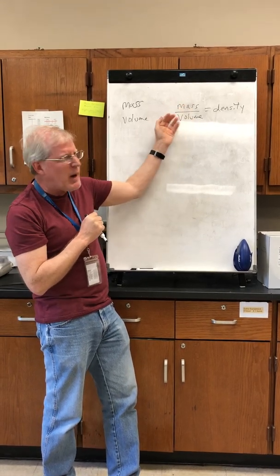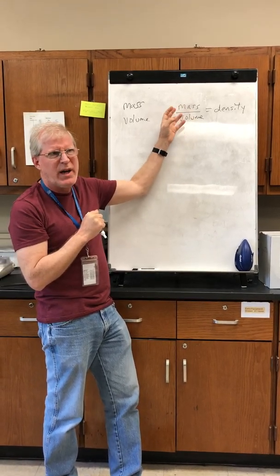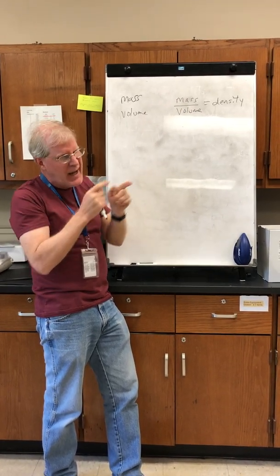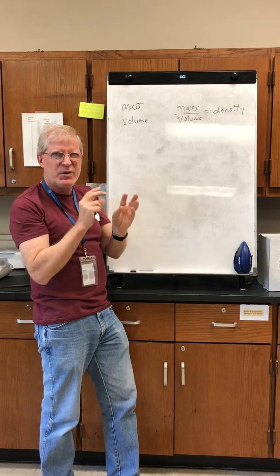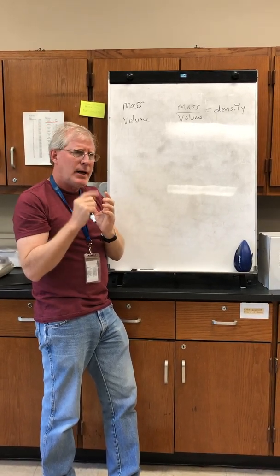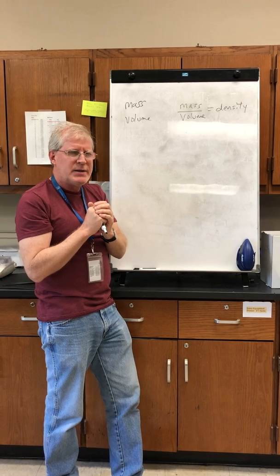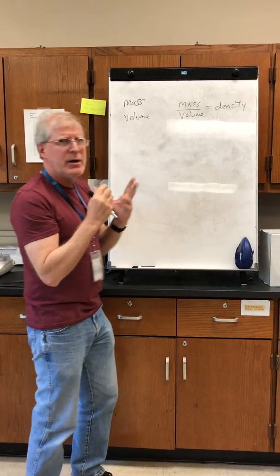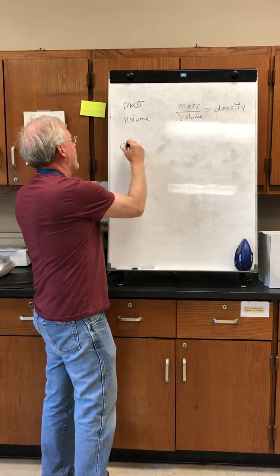So that's the background of what density is and how we're going to measure it. And when we go over to the lab over here, you'll see the finer points of the technique. Now, the last thing I need to talk about, a common calculation for most labs, is calculating your percent error.